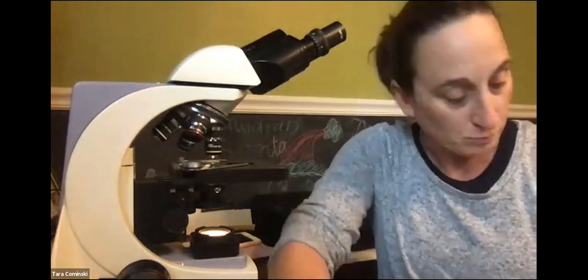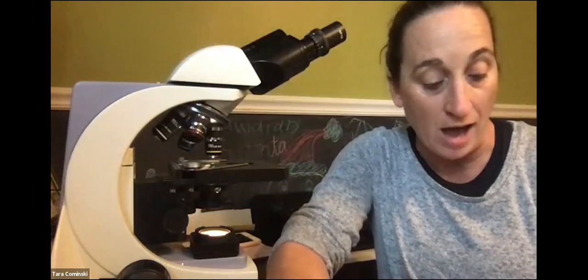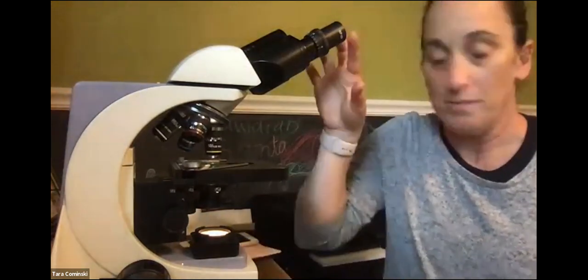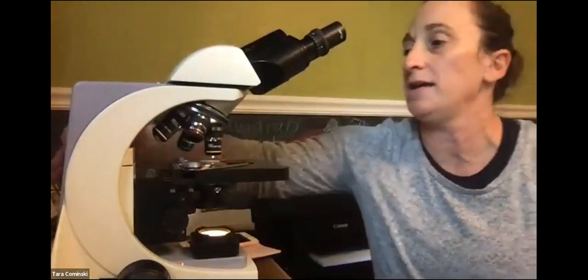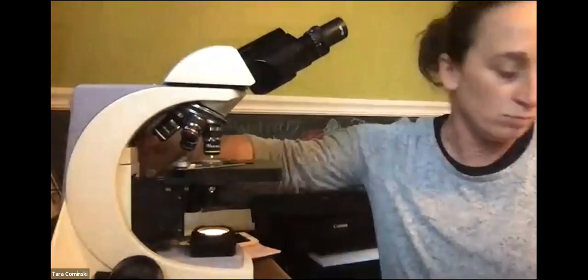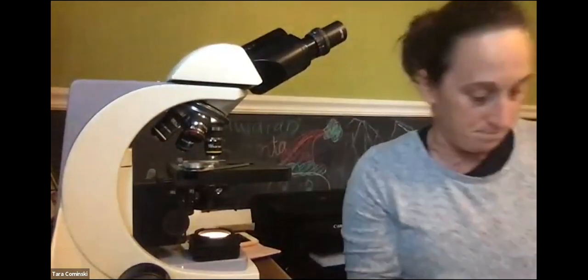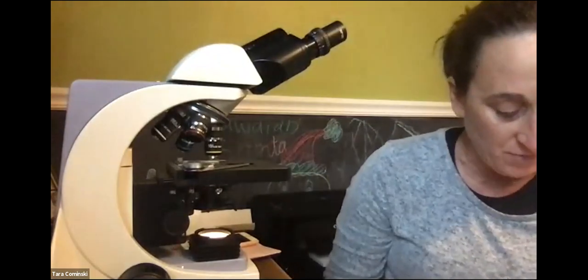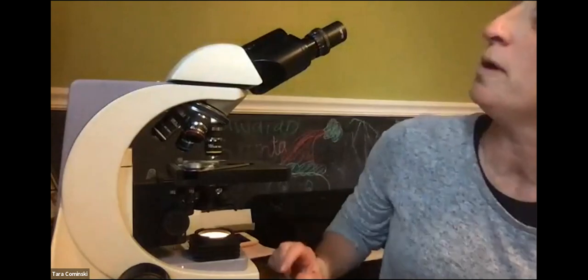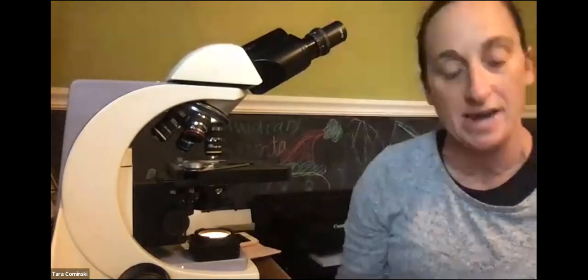So the eyepieces, right? It says some light microscopes are monocular, only one, and some are binocular. So ours is binocular. I don't know if you can see that, but, sorry, let me just turn that. There are 2 eyepieces in ours. And it says, what is the magnifying power of the ocular lenses on our microscope? The answer is 10x. The ocular lenses are 10x.